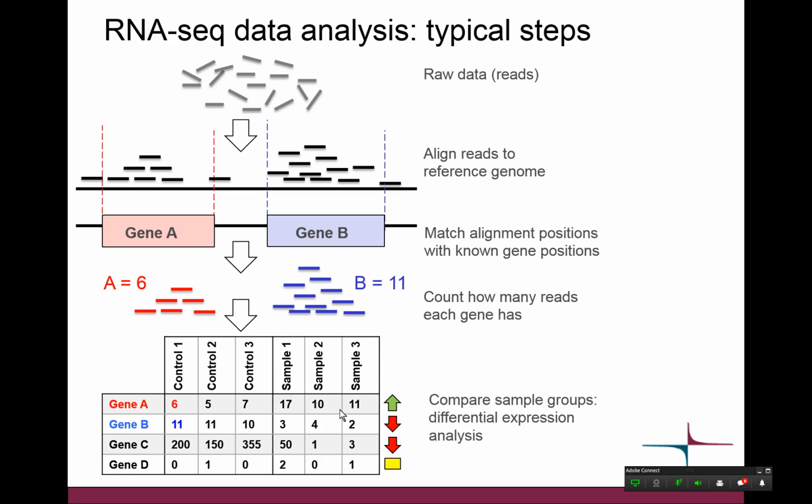Yes, so indeed that was the short description of Chipster, and now we are moving to the actual data analysis part. So this is the really simplified overall analysis steps. Okay, there seems to be one question in the chat box. I will answer to that after this part.